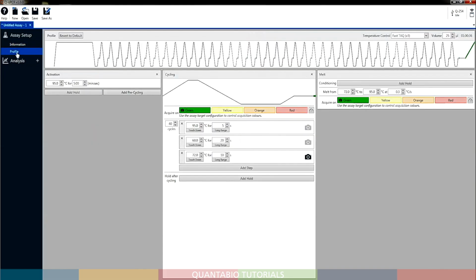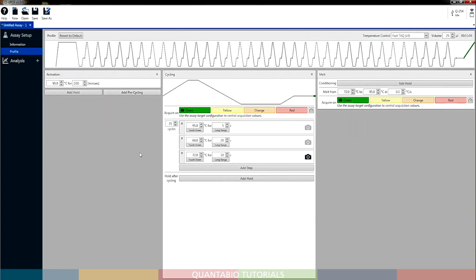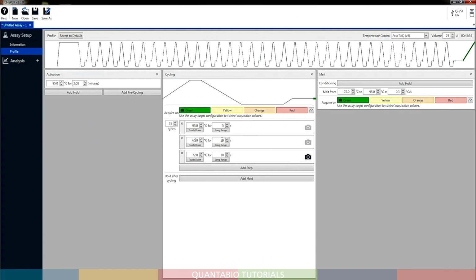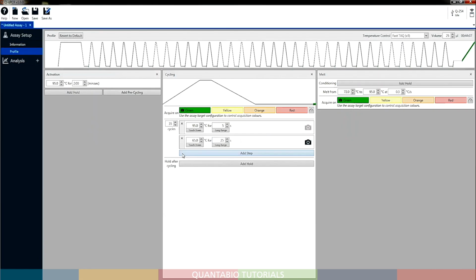Any of the parameters can be modified here. Here we show how to enter the recommended settings for the Spark Fast Library Quant kit. The first panel is for the hot start polymerase activation step. The temperature can be kept at 95 degrees and the time can be changed to 2 minutes by either typing it in or using the control box arrows. We recommend running 35 cycles for this kit. Denature at 95 degrees for 5 seconds works well. The annealing extension should be adjusted to 65 degrees for 25 seconds. The recommended protocol is 2-step cycling, so remove the 72-degree step by clicking the X.